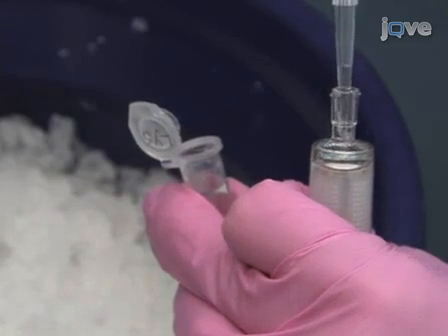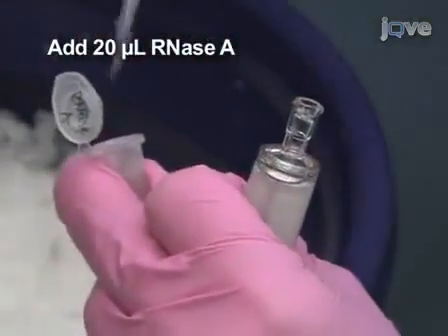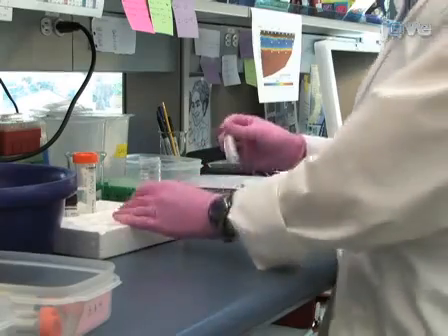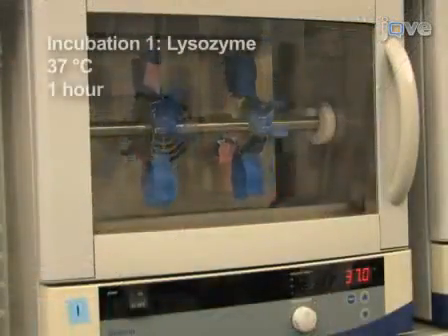For the first incubation, add 100 microliters lysozyme and 20 microliters RNaseA to the filter. Re-seal the filter with parafilm and leave it to rotate at 37 degrees Celsius for one hour.